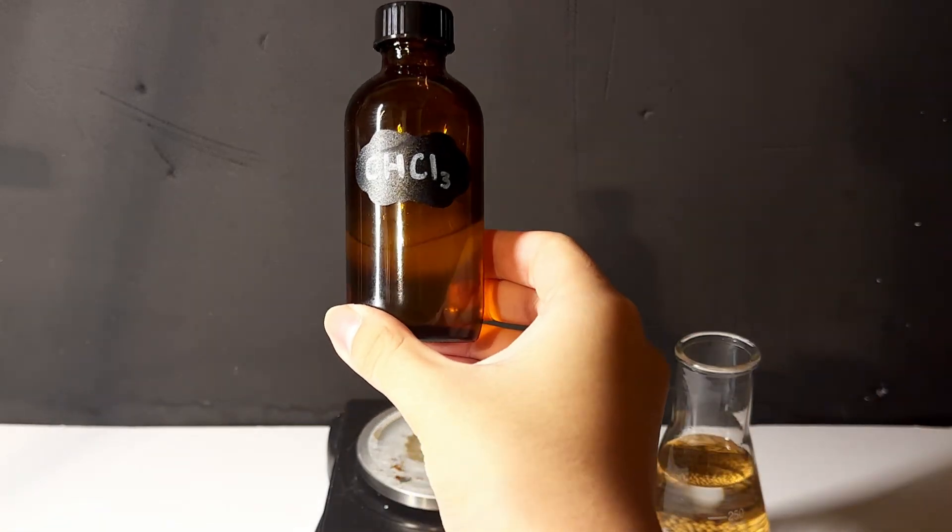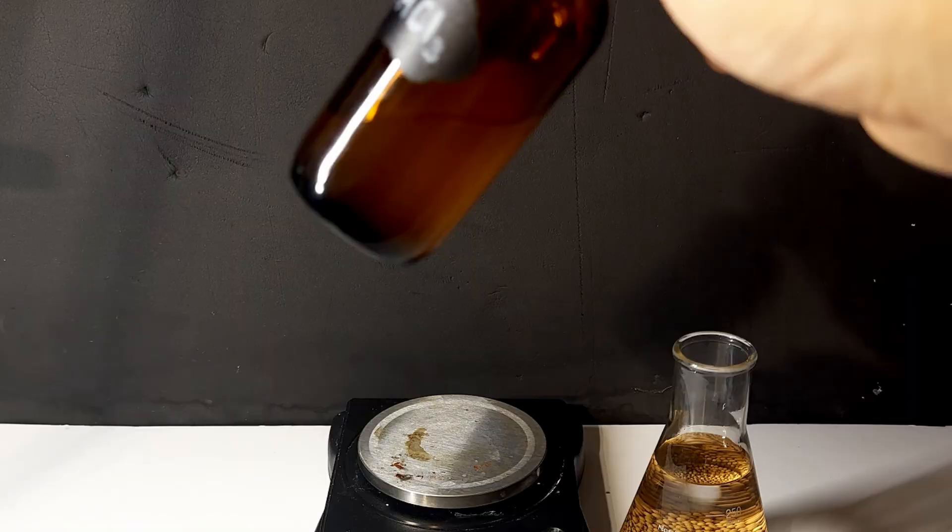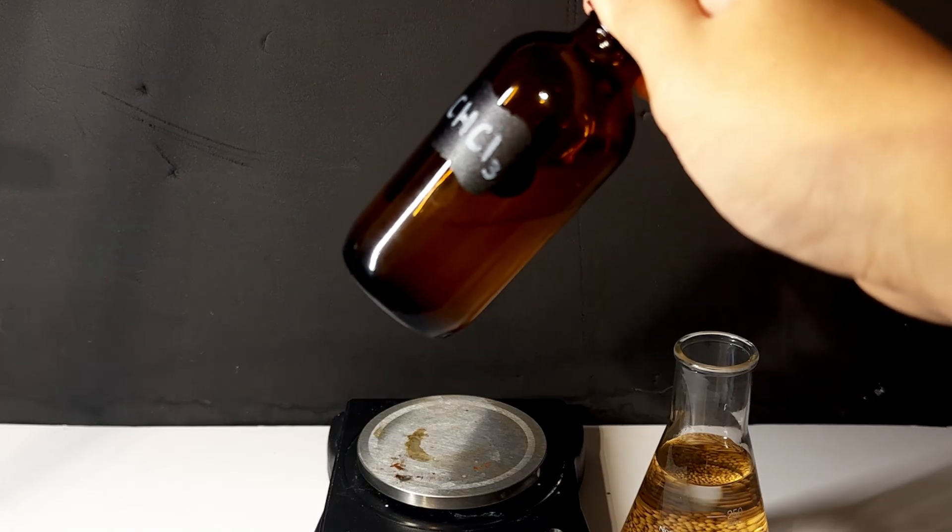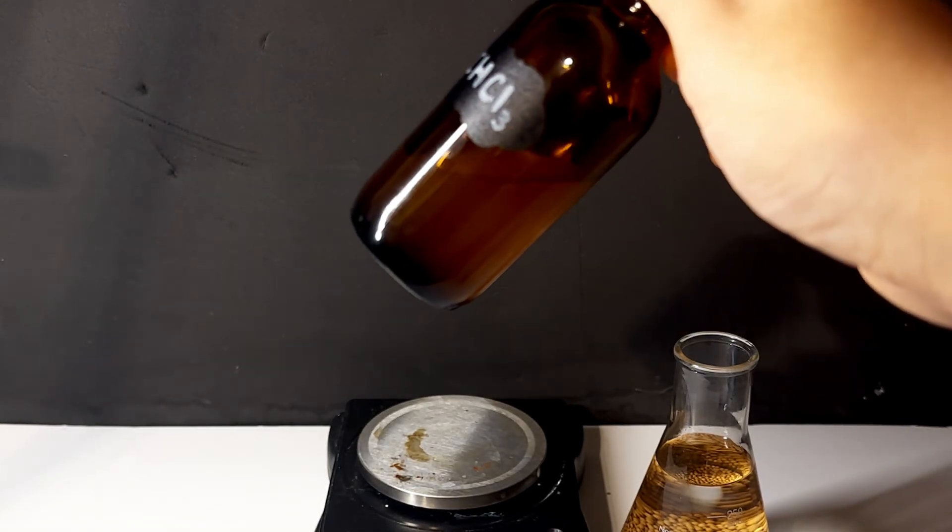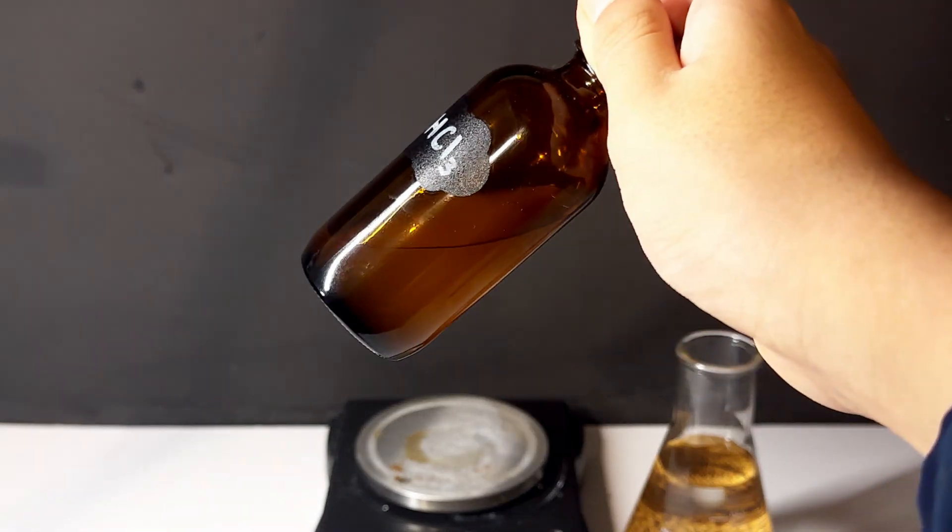As you can see here, when the ethanol is added to the chloroform, it kind of becomes cloudy, but after giving it some time it seems to clear up. This was kind of confusing. Does anyone have an explanation for this? Please let me know.